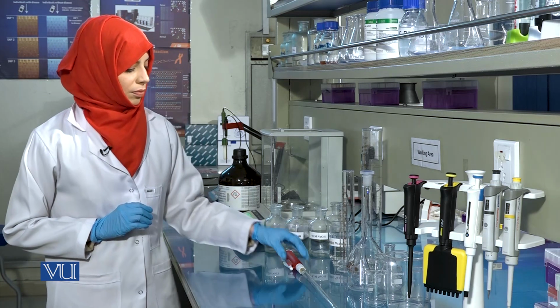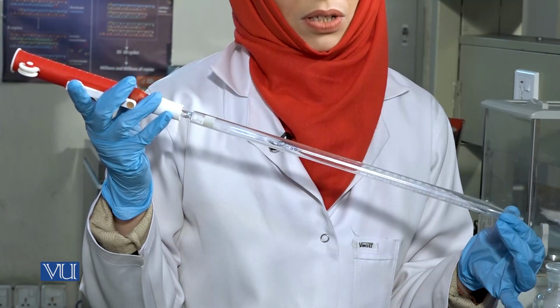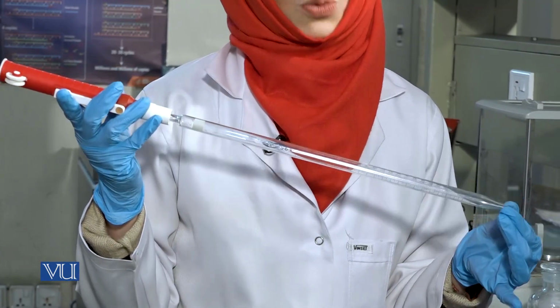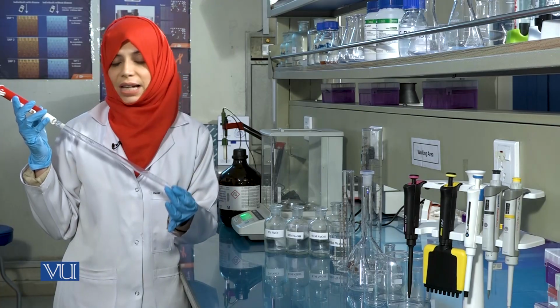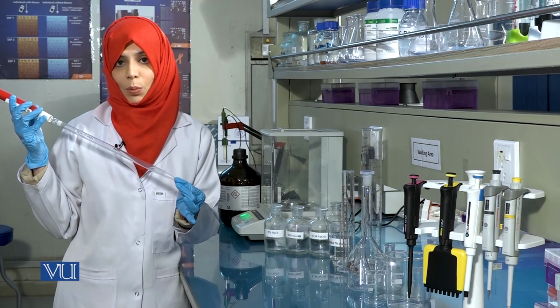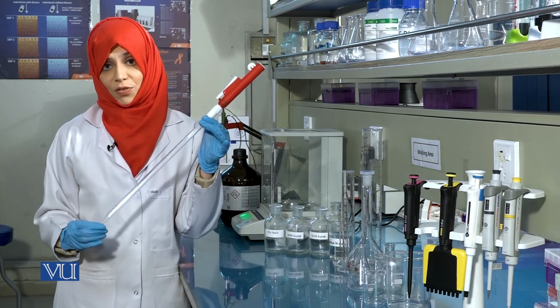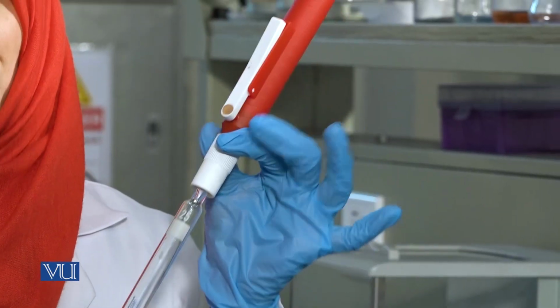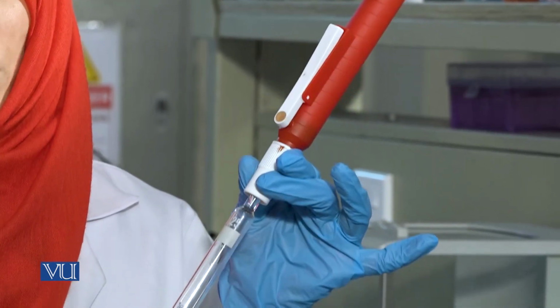But before that, we need to get acquainted with the glassware used for this purpose. This is a glass pipette that is used to transfer fixed volumes of liquids from one container to another. The pipette that I am holding at the moment can measure up to 25 ml of the liquid. Remember that you should never use mouth pipetting for transferring liquids. Always use a pipette sucker, pipette filler or pipette bulb for transferring the liquid.